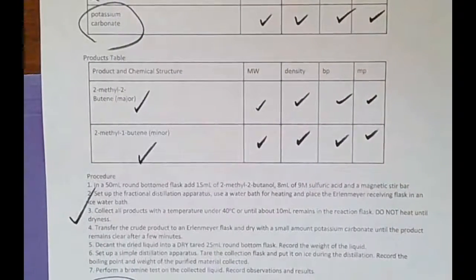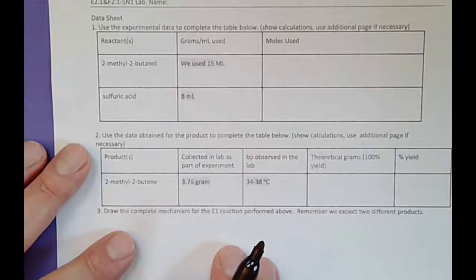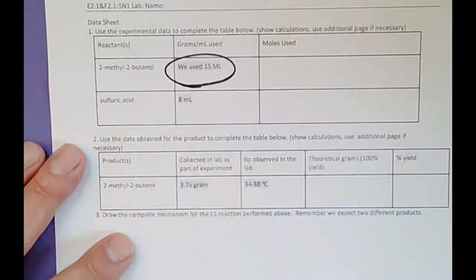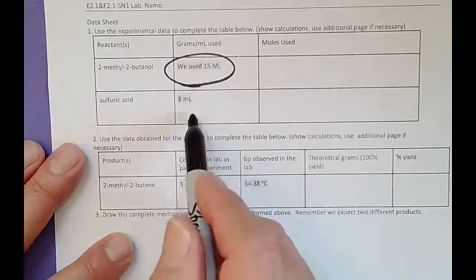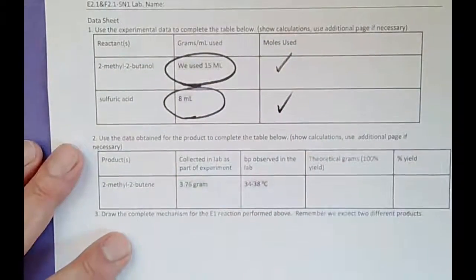This also has two pages. On page 2 is the product. When we went to the lab, we did the distillation, as you'll see. I propose that we use 15 ml of the alcohol and 8 ml of the sulfuric acid. Then we ask what the moles would be, so you can calculate that.